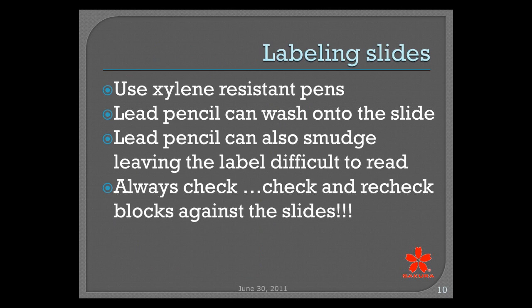Slide labeling. I recommend that everybody use xylene-resistant pens, but I have learned over the years that with each box, you need to test a pen that comes out of that box. Every time I open a new box of xylene-resistant pens, I'll just put an X on a slide, dip it into some alcohol, dip it into some xylene, and make sure that it's still there.